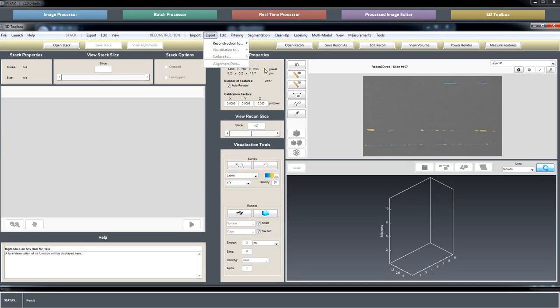I'm not sure. I know Avizo... Well, I know Autodesk's. No, to be honest, MIPAR is definitely not going to be the speediest with that amount of data loaded in. No, yeah, meshing isn't something that we support right now. I've done that type of work, and I think I've used Autodesk products.